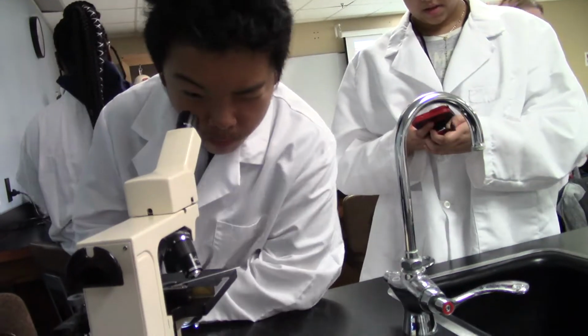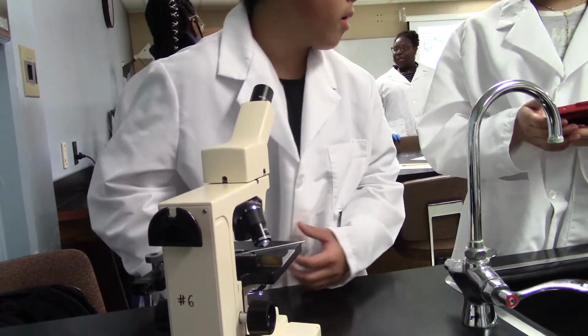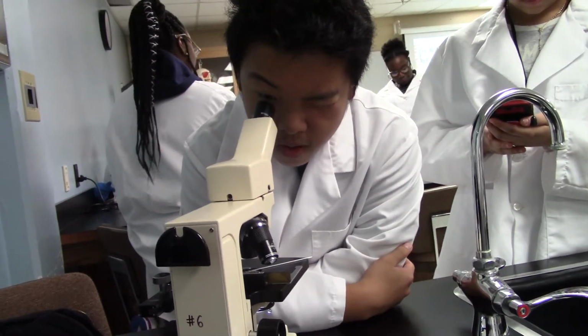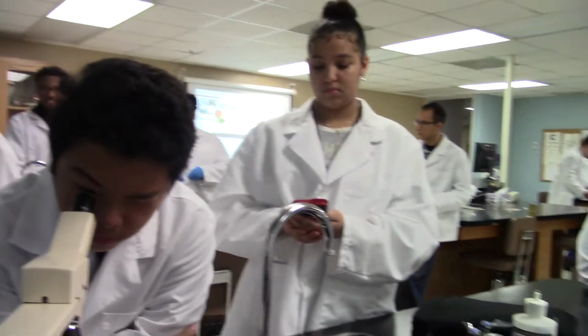Yeah, whatever you need so you don't mess up. Once the timer starts, let him look in and see where the blood is. Just focus in on one part of his little body and count how many times you see that push.